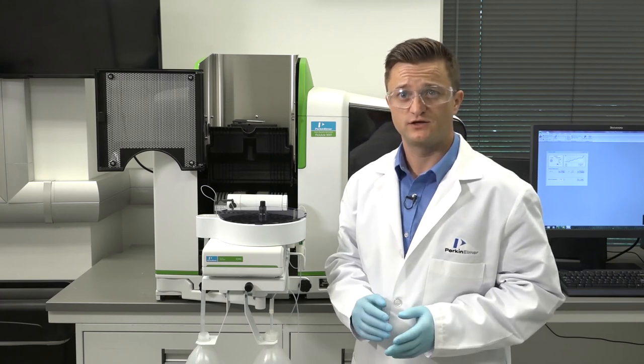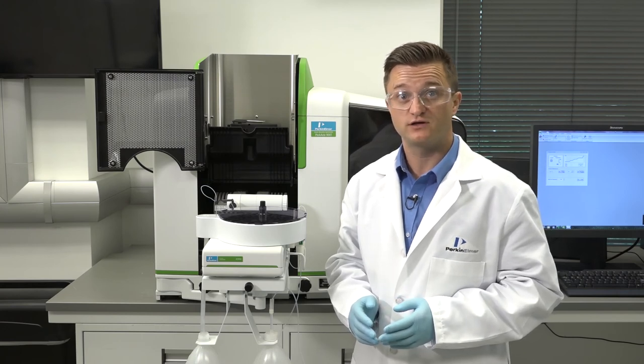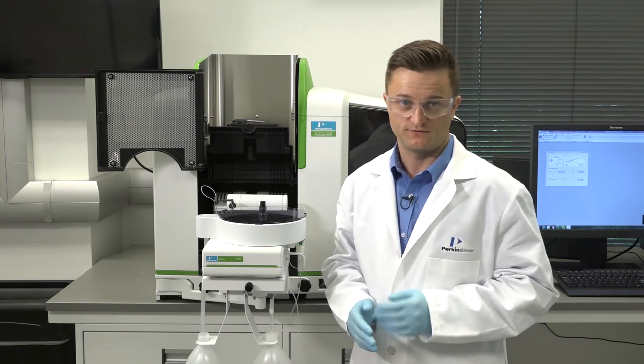If you are installing a new graphite tube, you will need to condition the graphite tube. If you are reusing a previously conditioned graphite tube, heat it manually at 2500 degrees Celsius for 5 seconds to remove surface contamination.